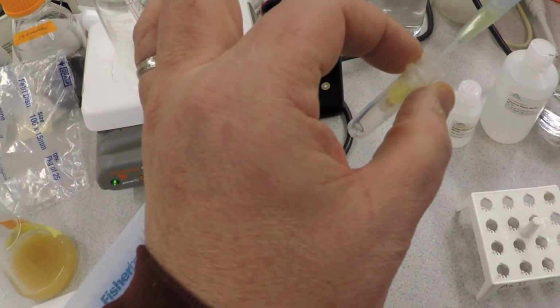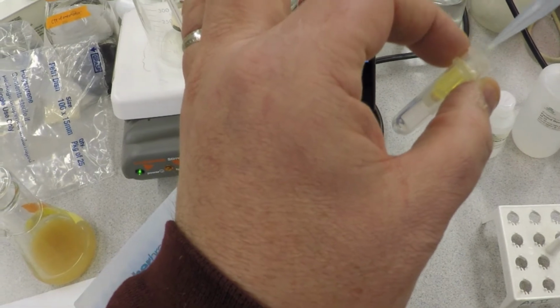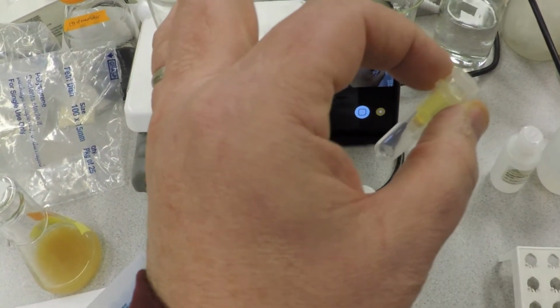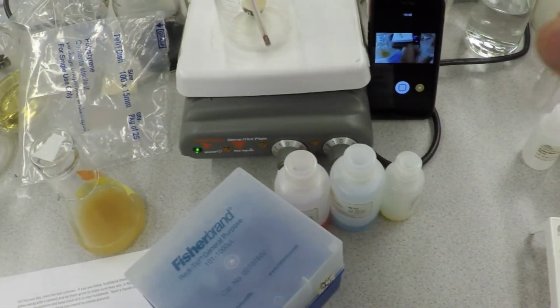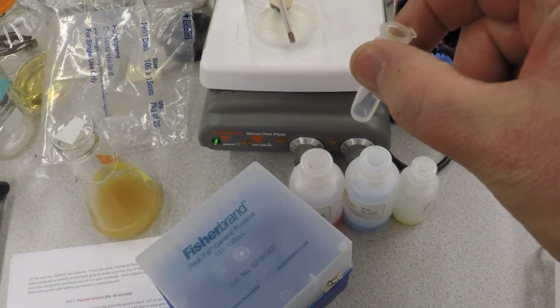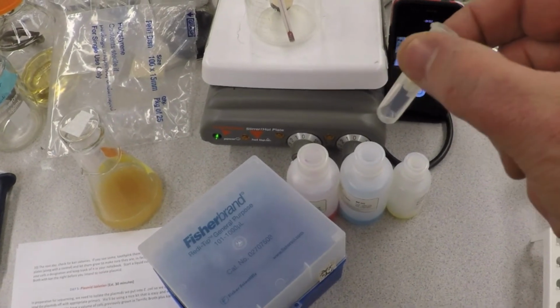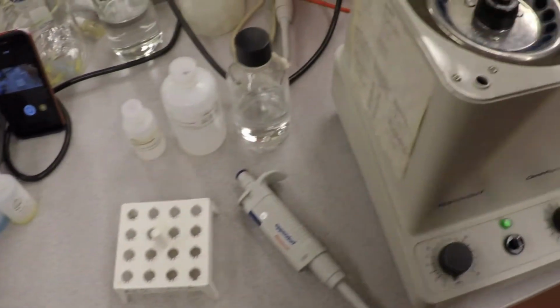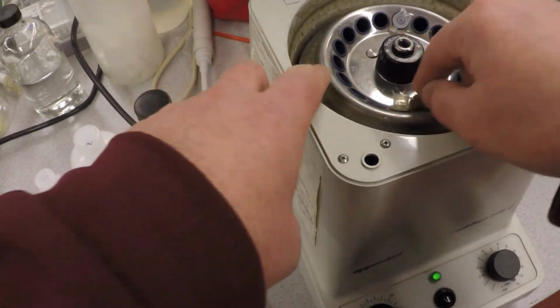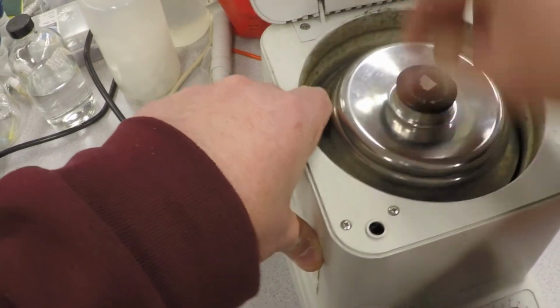But ordinarily you do. So here this is this little sample thing. Pick it up, put it in this column. Alright, now it says take this in this little container, just the way we have it, and centrifuge the column for 30 seconds. Again, this is at high speed. So you put this in here. It looks like it's not going to fit, but it will. And there's no top on it.